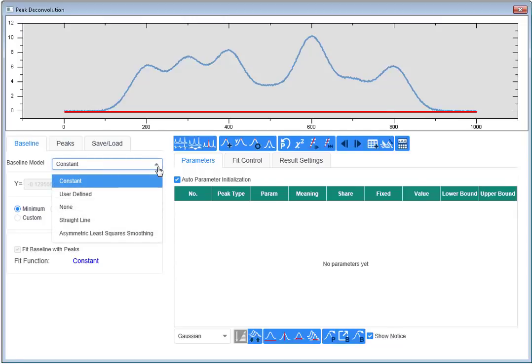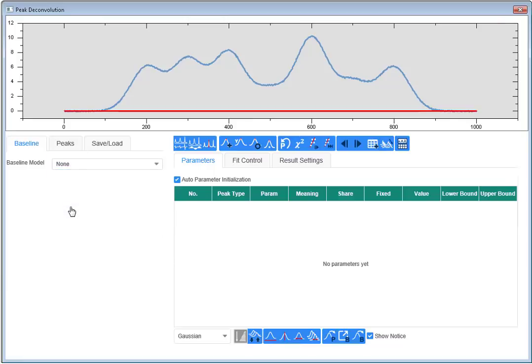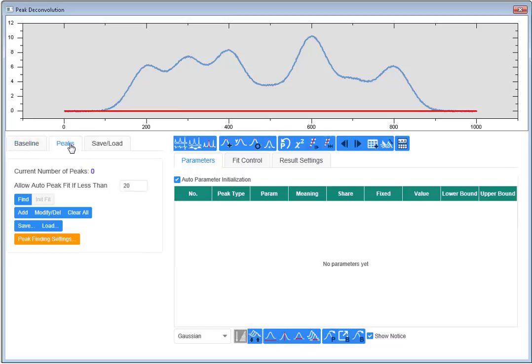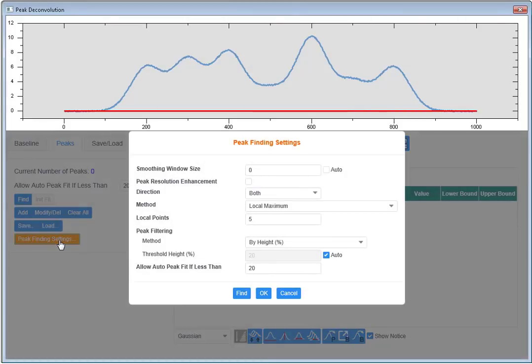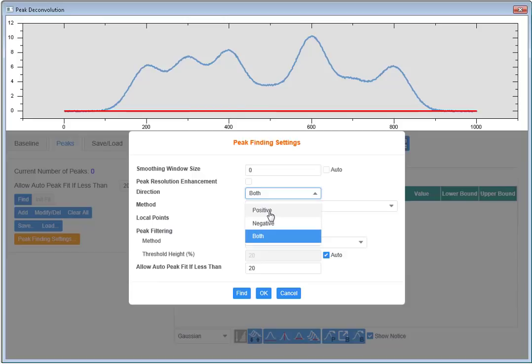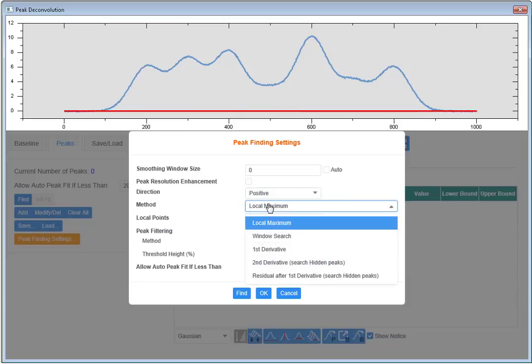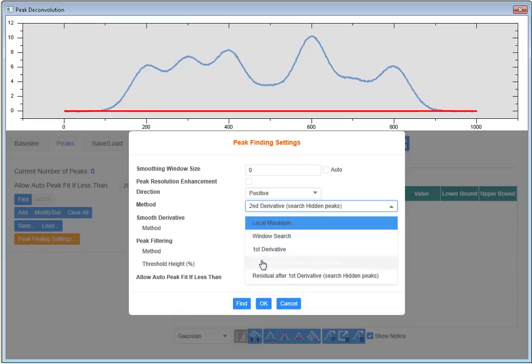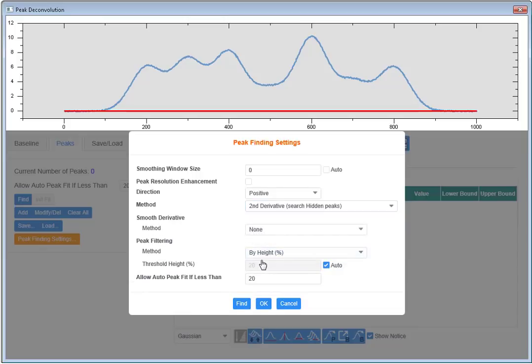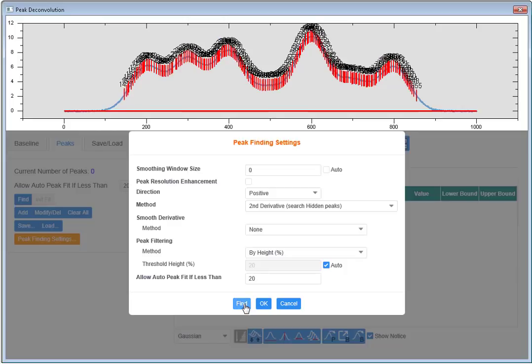For this example I will select none so that no baseline is subtracted. Now let's select the Peaks tab. Similar to the Peak Analyzer, there are several methods for finding peaks. I can restrict the peaks to be positive only, and because there are overlapping peaks in this data I can choose the option second derivative.